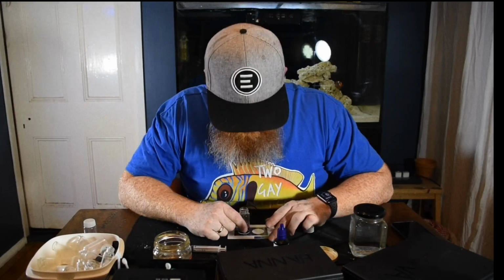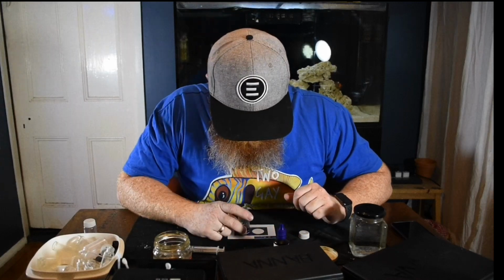Alrighty. So funny thing is, every time we've done a pH test, every single time, since day one through to, not today, because it makes a liar of me, so we won't talk about this. But normally our pH is exactly 8.2 every single time. Today it is a clear 8.0.